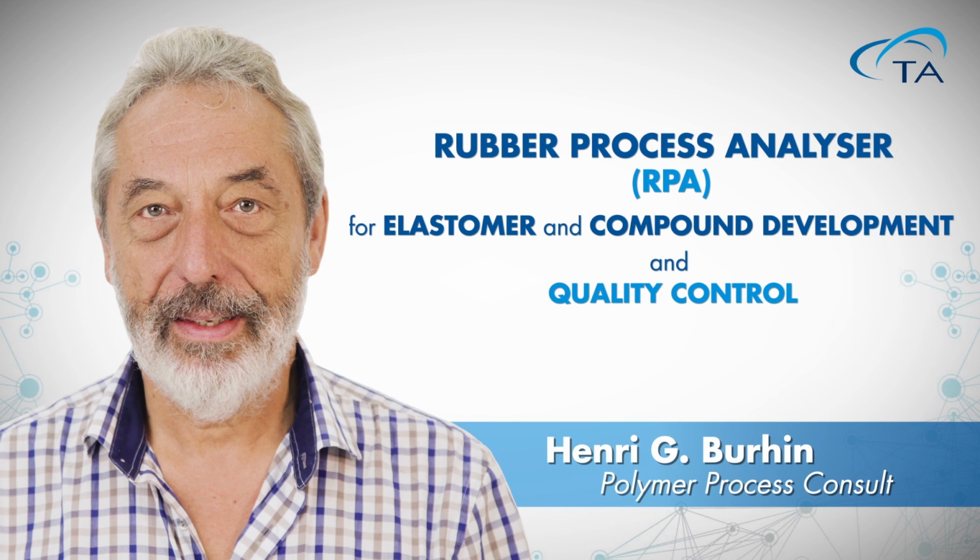Okay. And again, coming to the long chain branching index, is there a theoretical background for the long chain branching index, or is it completely empirical? And if there is a theoretical background, can you comment on what's behind that? No, it's purely empirical.